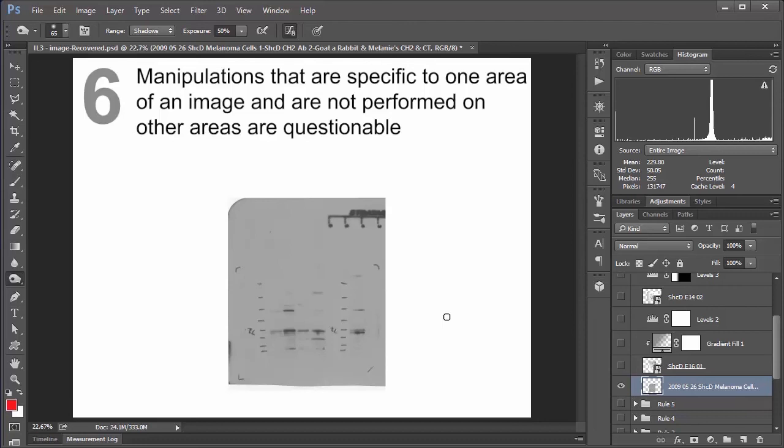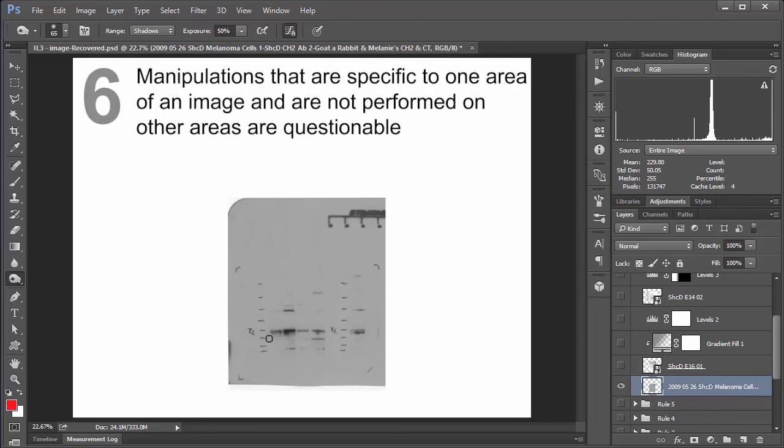But he says pretty much every other time is not acceptable. And he specifically gives an example of if you have a western blot like this, and I'm hesitant to even show you this because I don't want you to use these powers for evil, but you don't want to be going ahead and just burning your bands in to make them look like they're darker than they really are. Because I think we can all agree that this is sketchy as hell. So yeah, don't do that.